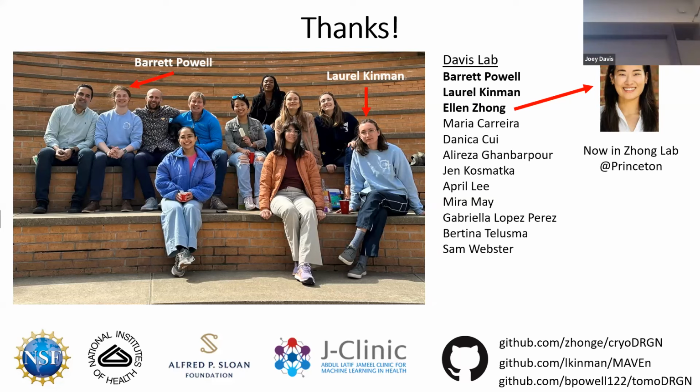That data allows you to generate a density map. And into that density map, you build an atomic model that's most consistent with the density map. And there's this firewall, at least in cryo-EM, between the density map and the atomic model. I think that there is some value to that. The downside is that if you know the protein you're looking at, you know its domain architecture, why not use that inductive bias to help you generate a better map?